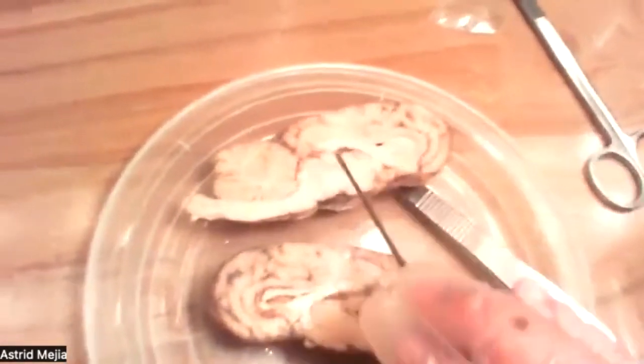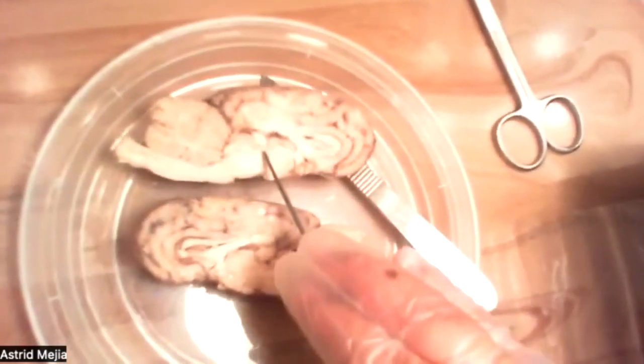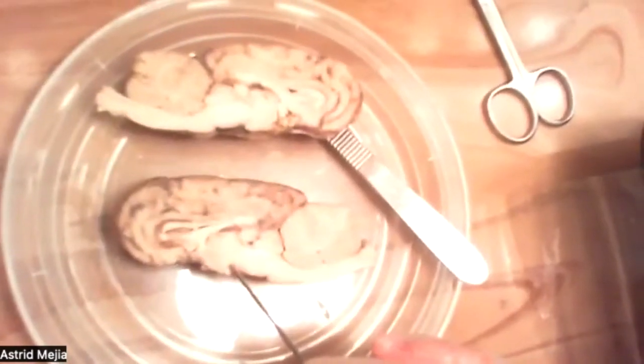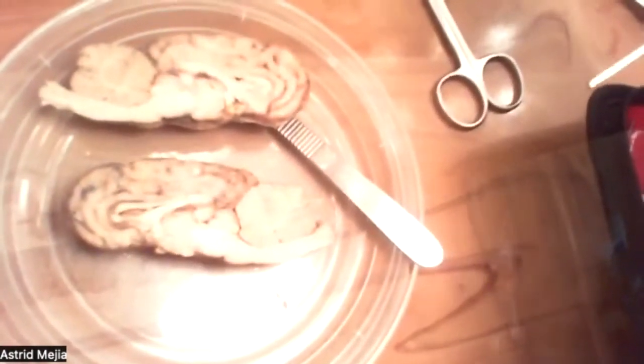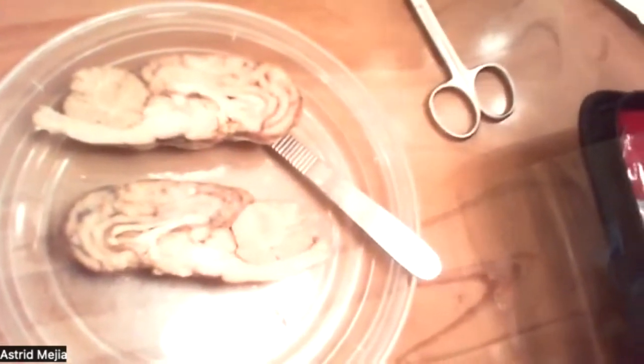And then you can also see the thalamus. The hypothalamus would be in the bottom, like right here, and then the thalamus is up here. The thalamus relays sensory and motor signals as well as regulation of consciousness and alertness.